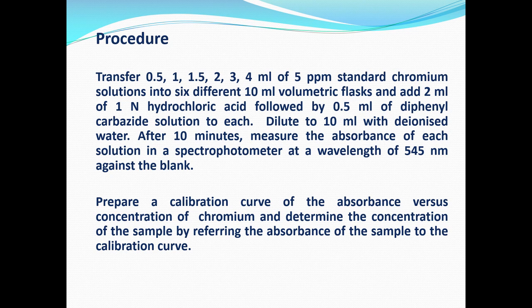The diphenyl carbazide you have to dissolve in methanol. Normally it is not easy to dissolve in water, so a certain amount of methanol, up to 50%, has to be incorporated in the solution. So, 0.5 ml of 1% diphenyl carbazide should be more than enough. Allow it about 10 minutes, then measure the absorbance at 545 nanometers.